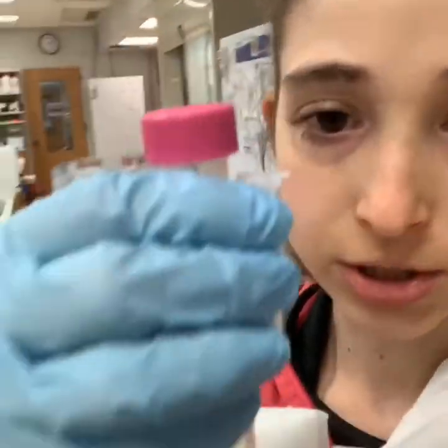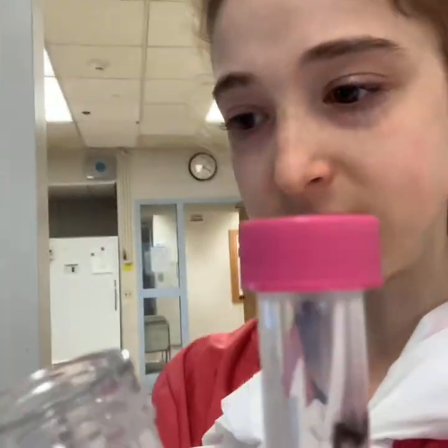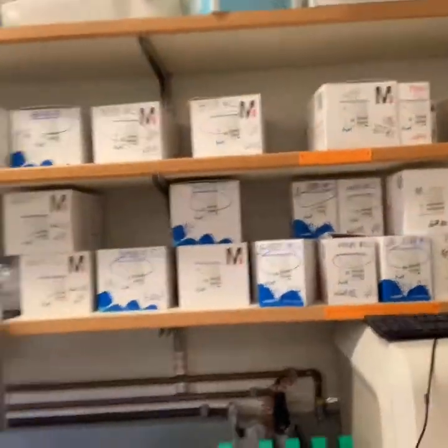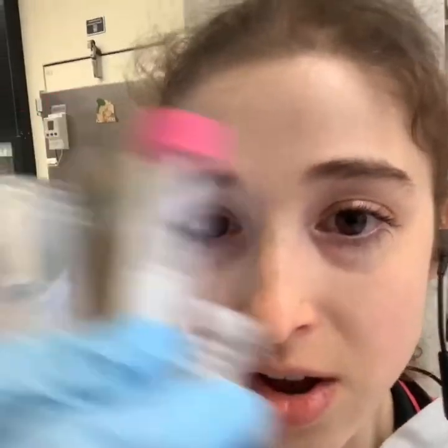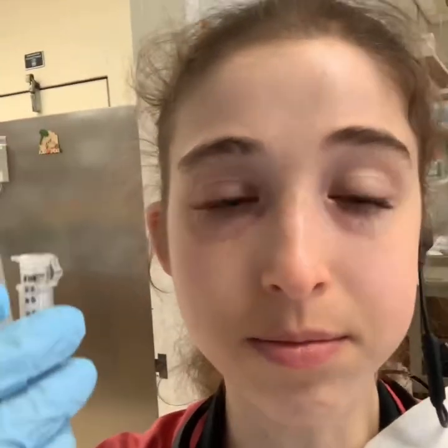These are all different versions of the 50k for different sizes — you have a 0.5 mL size, a 5 mL size, and a 15 mL size or so. We have all these different options in different molecular weight cutoffs: 10k, 30k, in all these different sizes because we use these a lot.